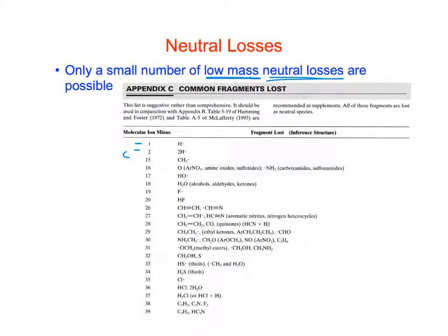And so if we see ions that cannot be generated by a logical loss, it means that our starting point, our molecular ion, is probably not right. Or we have a mixture of compounds or something like that, right? An impure sample. So uncommon ones are things like between 3 and 14. Those are not logical losses.